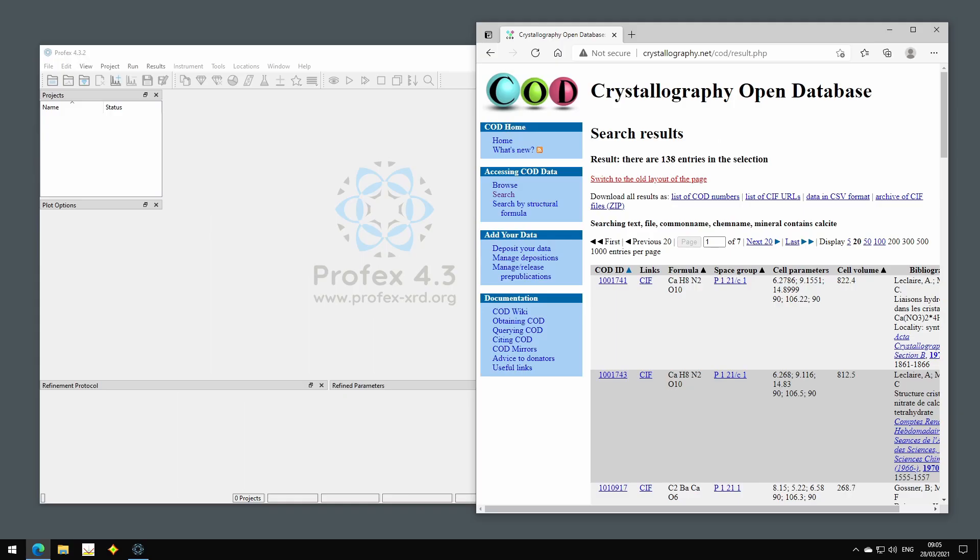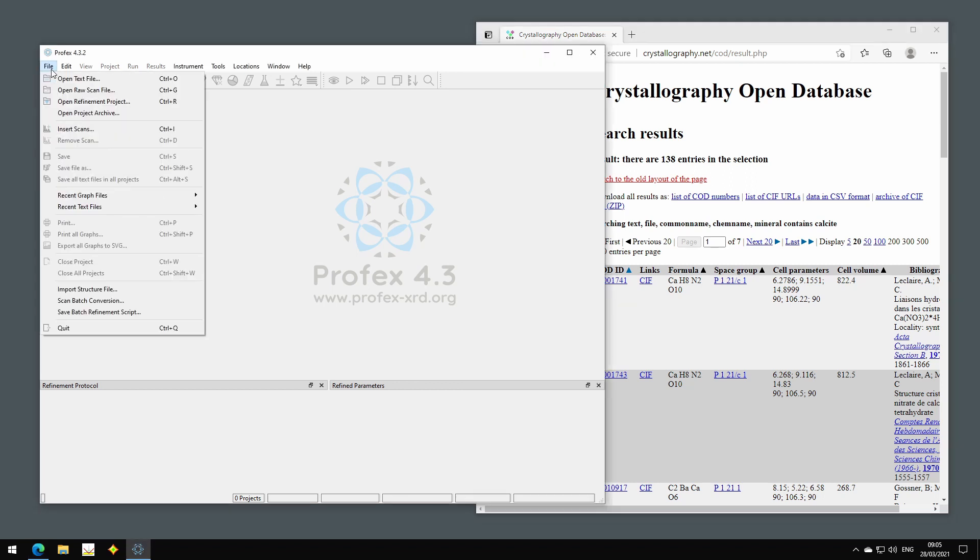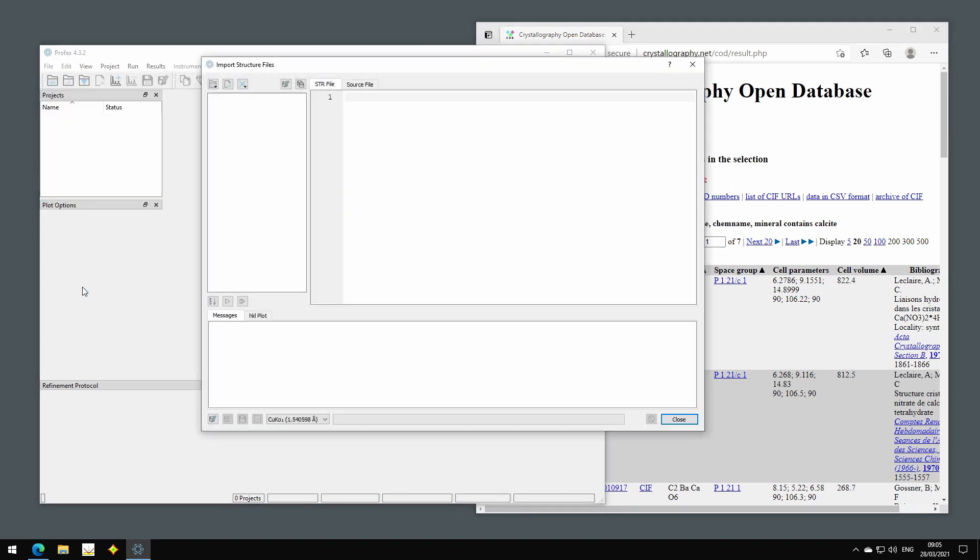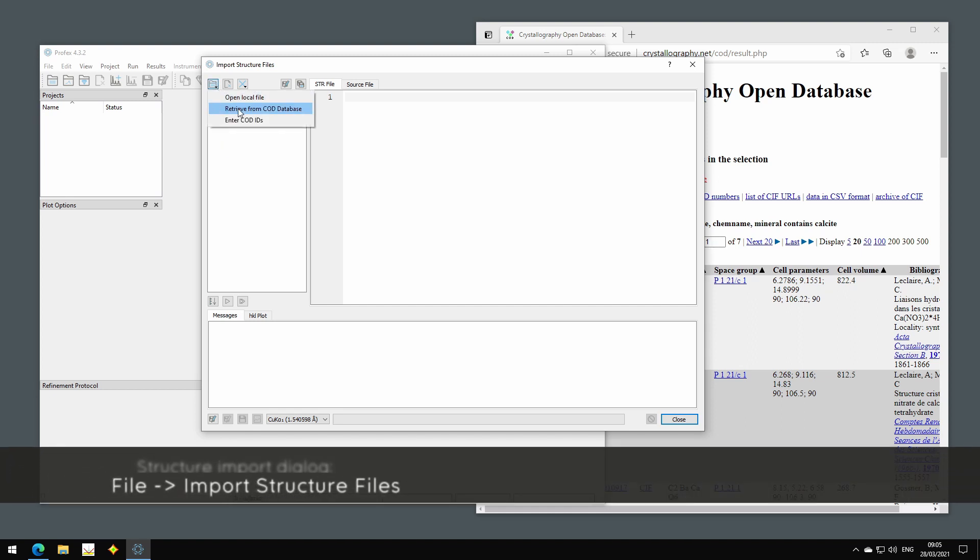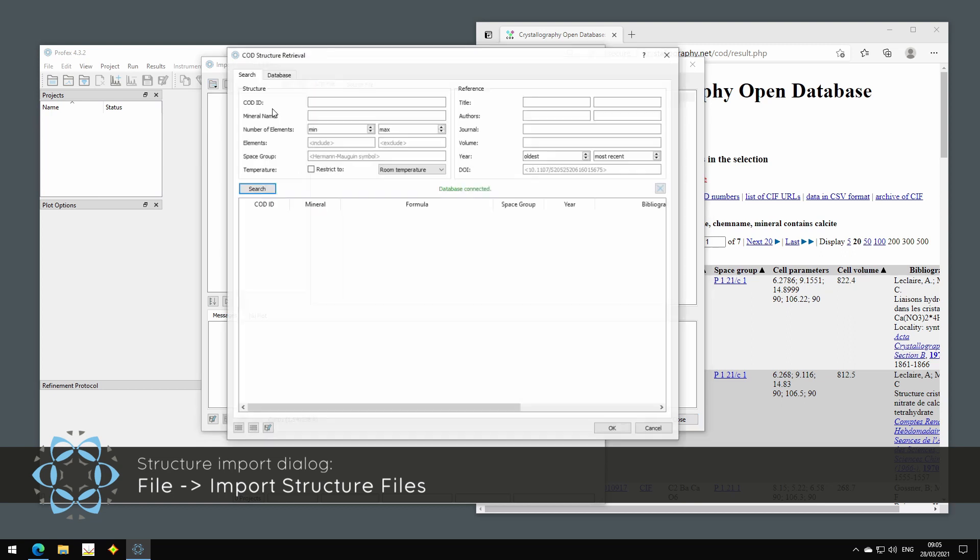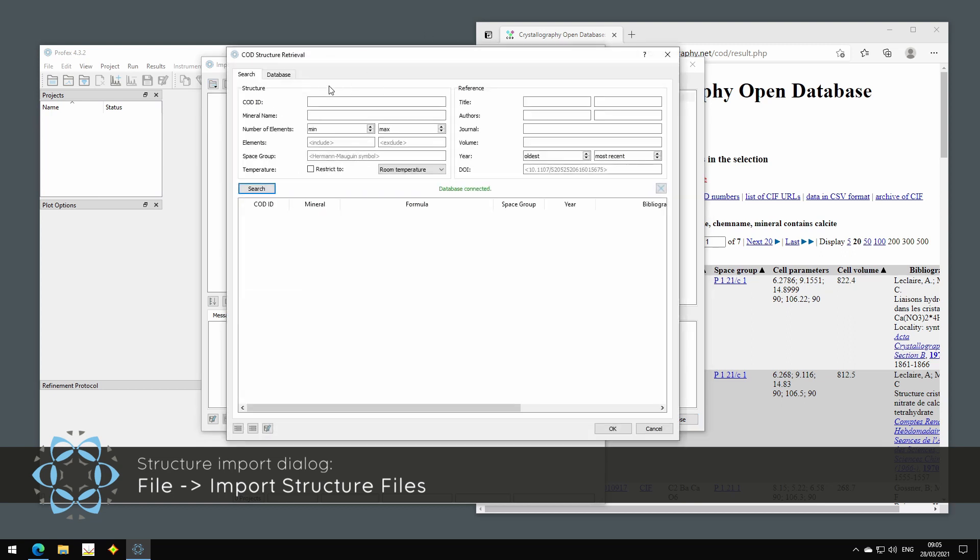There are also some improvements in the structure import dialog when we access the COD database. We have this retrieve COD database dialog where we can search in the database and download the structures from there.